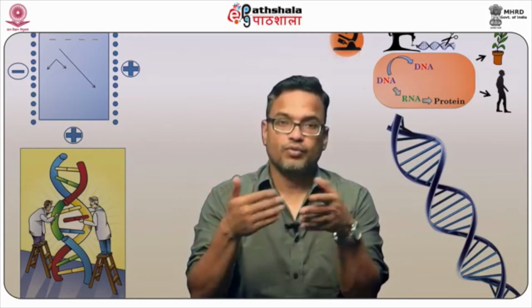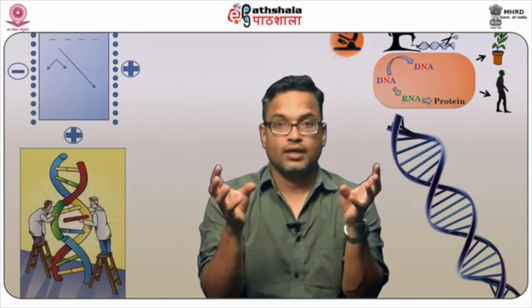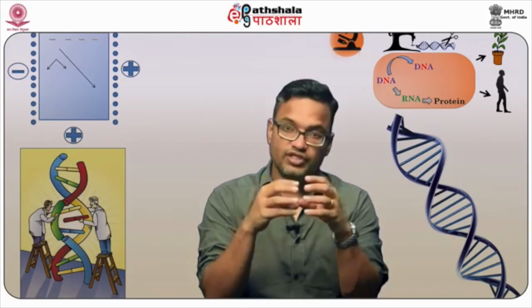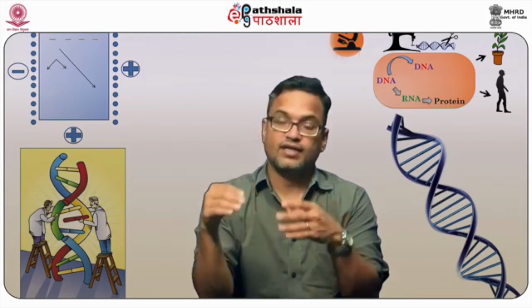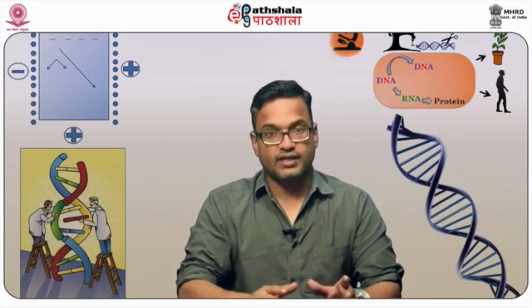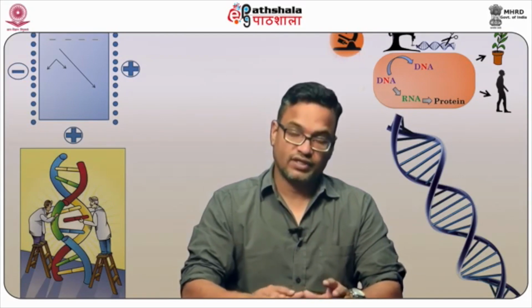And on the other end, the SNOM is also based upon the interaction of the evanescent wave that is generated once light of a specific wavelength is passed through an aperture smaller than the wavelength. It generates an evanescent wave which resonates in that area and also gives information about the sample it is interacting with, and that information is used to generate high resolution imagery. So these two techniques are very different from the light and fluorescence based imaging microscopy which we discussed earlier, but give another dimension to the applications available with the range of microscopy we have available.